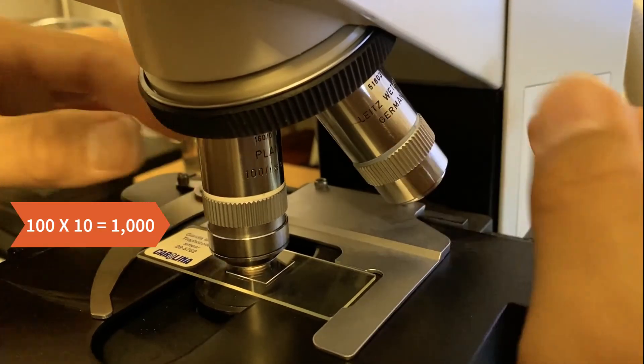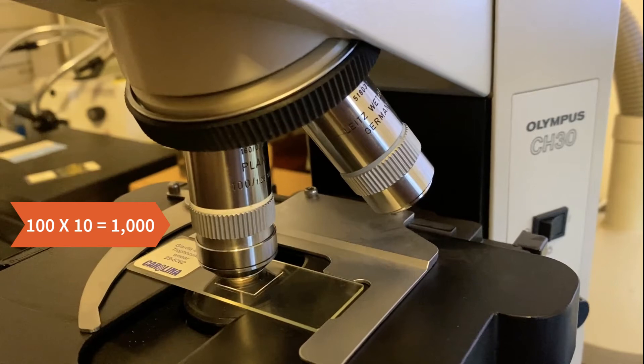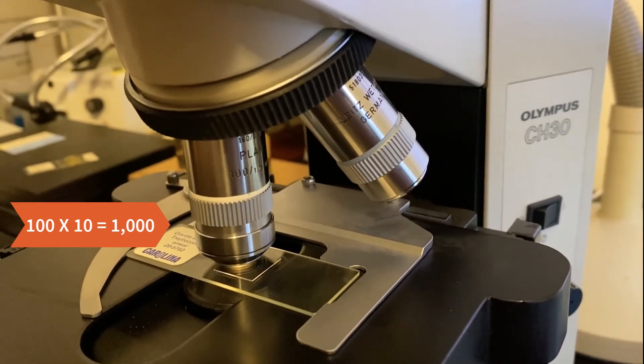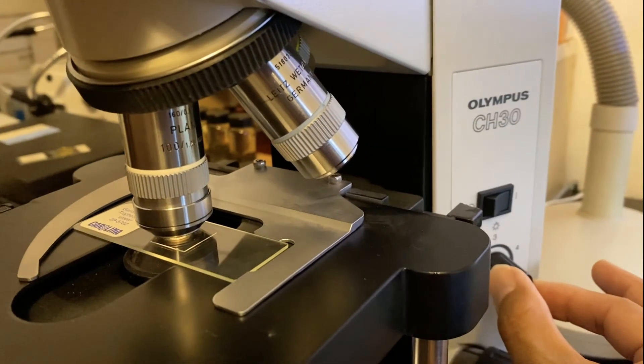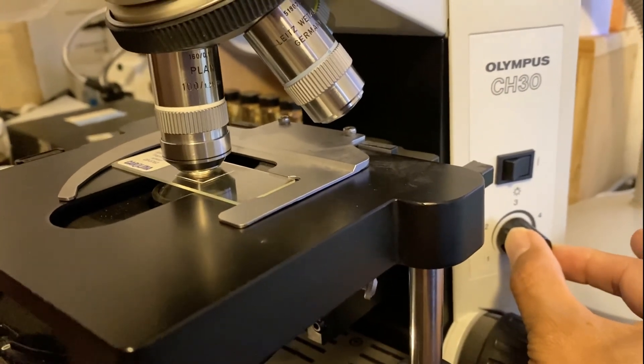Again, 100 times multiplied by the eyepiece, which is 10 times, that is now at a thousand times magnification. And I can use my fine adjustment to bring this specimen into focus. Giardia in particular is super small, so you have to be very careful using that fine adjustment.